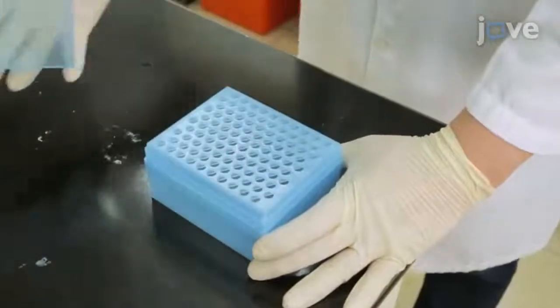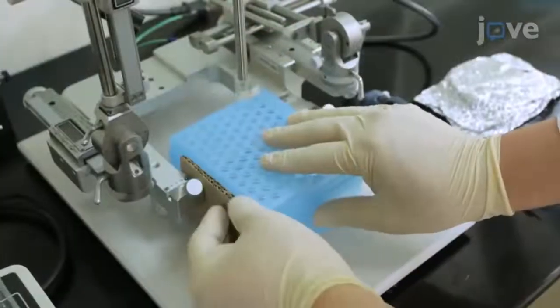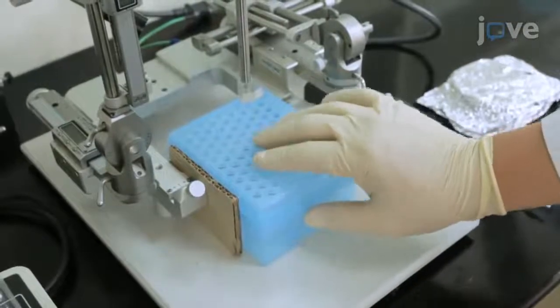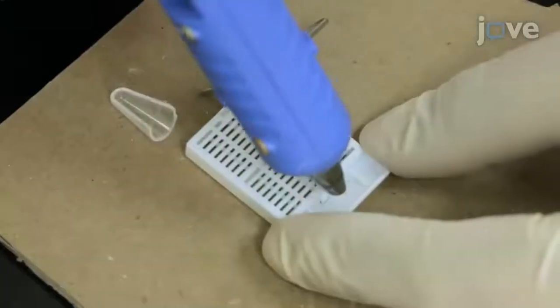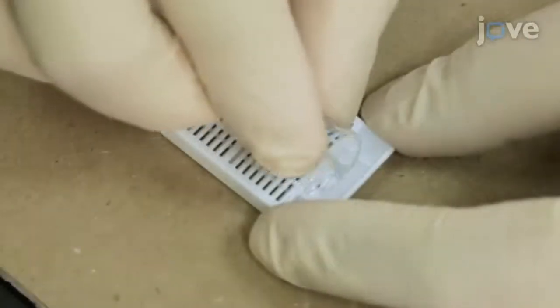Next, select an empty pipette tip box that fits the pedestal of the stereotaxic apparatus. Then, use hot glue to secure the head tray to the base of the tip box.